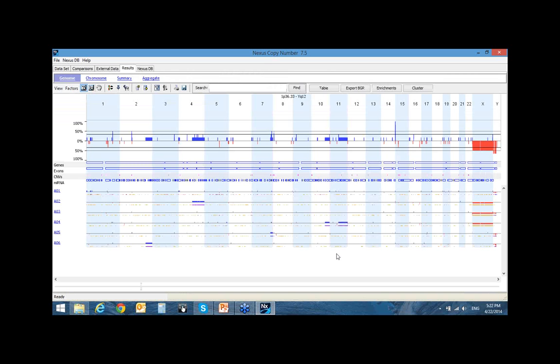And here we go. So you got the results. Once the data is loaded, then it's automatic. So it's pretty simple to the users. You load in the data, the software is going to take over and give you the results right away. As you can see here, we have a trisomy, and it's not the entire chromosome. On the full Q, you get a gain. There's the 2Q region. You have a gain.